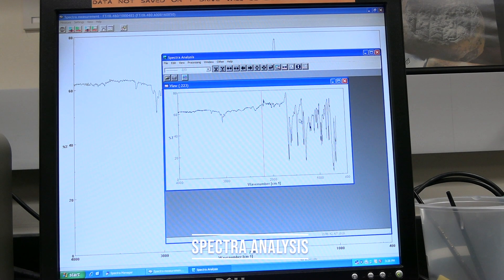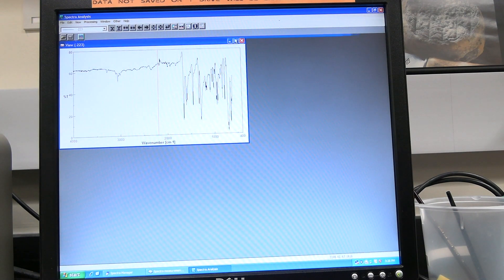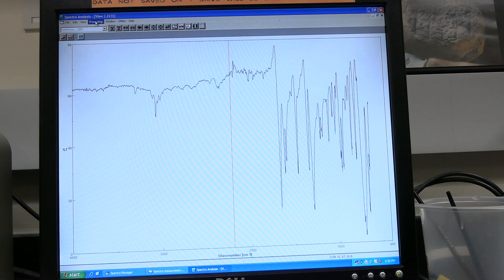Spectra analysis. Spectra analysis should be automatically open after the first measurement. Subsequent measurement data will automatically be sent to spectra analysis. Expand the window if needed. Click on processing, then peak processing, and then on peak find.